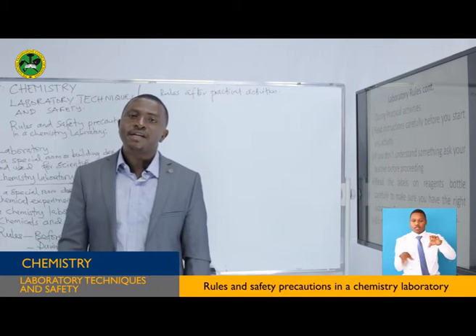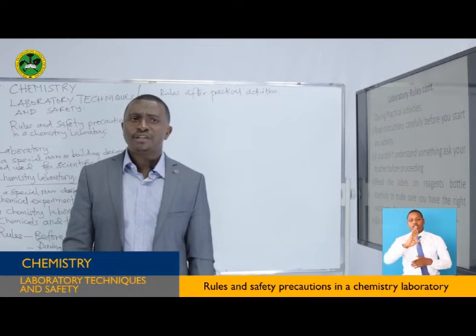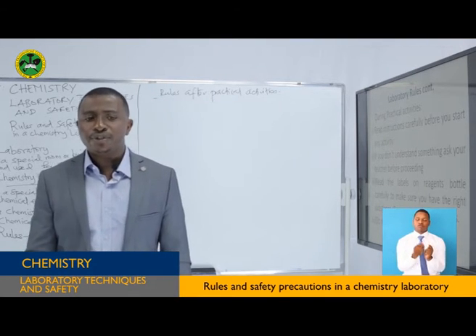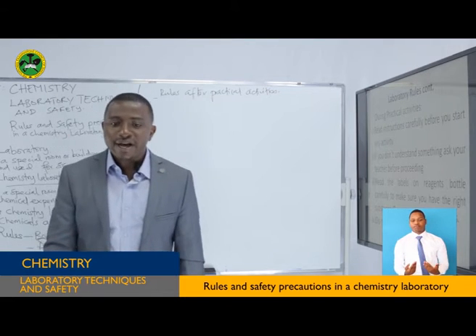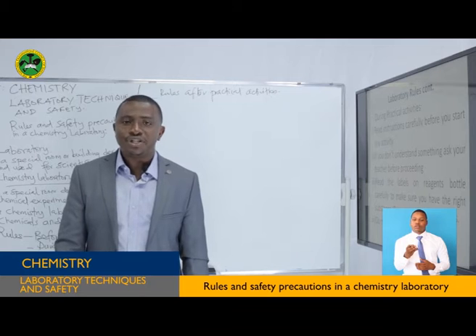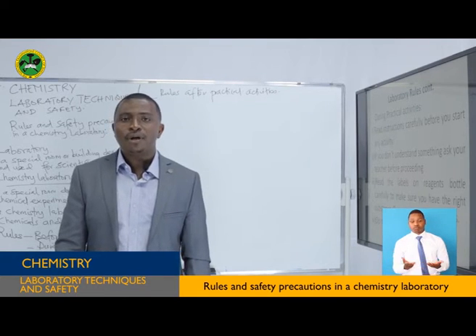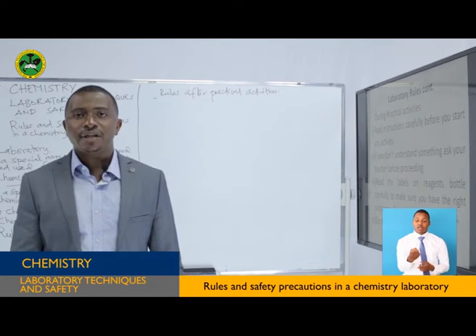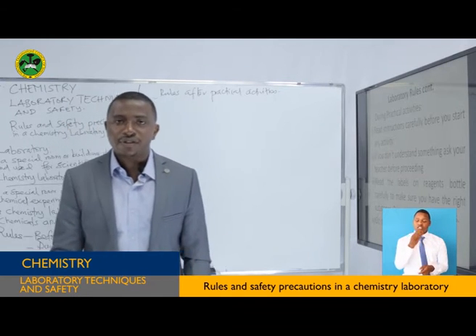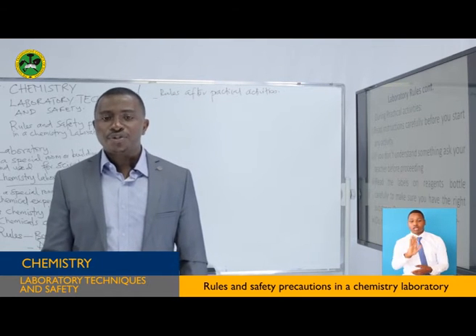They might come in contact with your drinks, they might come in contact with your food. So you are very much advised not to drink in the laboratory. Some say, no, I'm sure this is my drink, it is not contaminated. Students, your drink can be contaminated accidentally without you knowing.